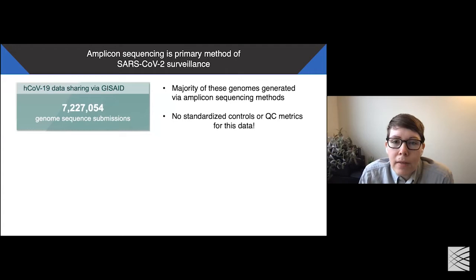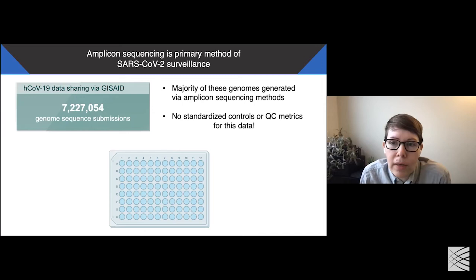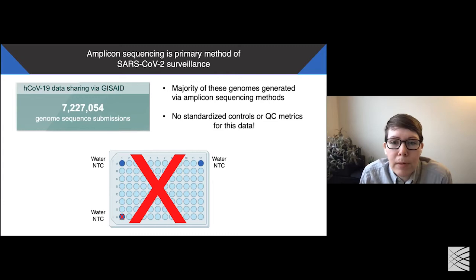As of today, there have been over 7 million SARS-CoV-2 genome sequence submissions. The majority of these genomes were generated with amplicon sequencing methods. Surprisingly, there are no standardized controls or QC metrics for this data. One commonly used control is the use of a water non-template control. Waters are added into certain locations on a sample plate, and if during sequencing it is found that a water has SARS-CoV-2 genetic material in it, then the entire plate is discarded and prepared again. This approach wastes time and resources to prepare samples again, but it does control for lab-wide contamination. This approach, however, can miss contamination events and sample swaps that occur farther away from the non-template controls, leading to erroneous genomes possibly being reported.